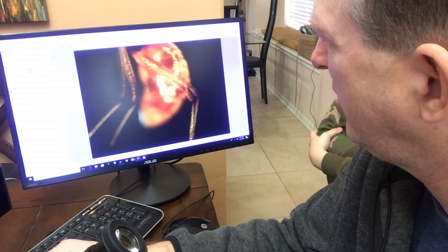Let's see if we can zoom in a little further. We need to lighten it up a little bit more. Look at that — you can really see the hair on the ant. It kind of reminds you of honey because it has that color — a brighter yellow.